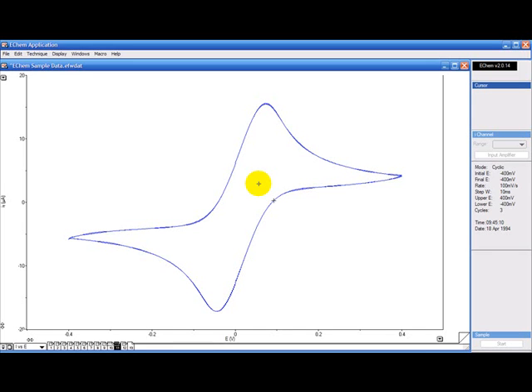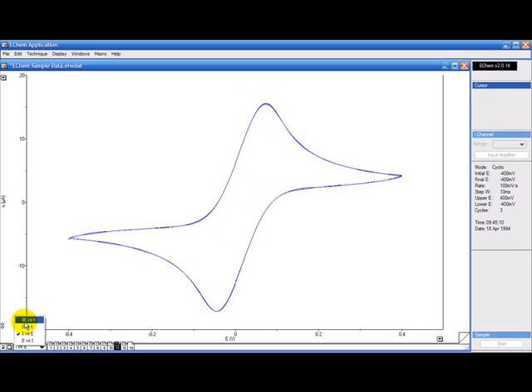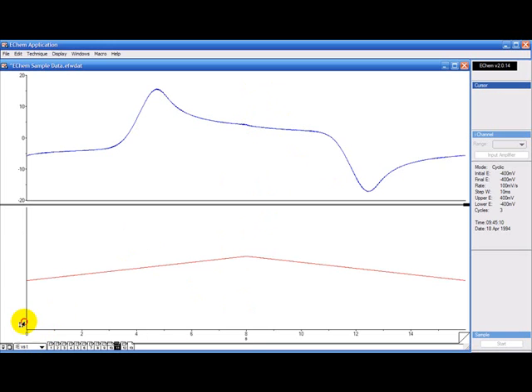The ECAM software lets you integrate the area under a peak. For example, if I want to find the area under this peak, I first start by changing the display to IE versus time.